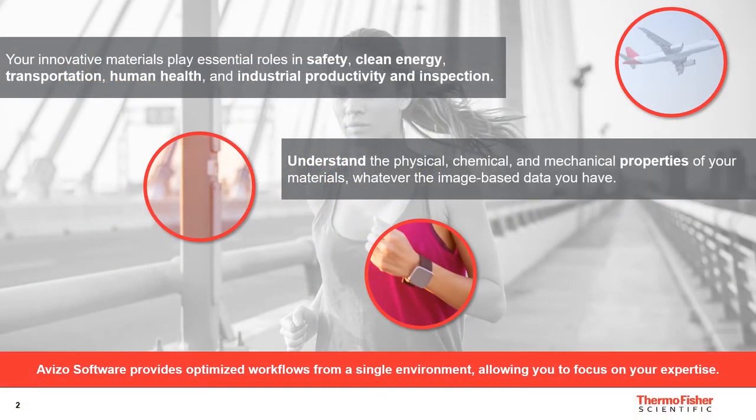Your innovative materials play essential roles in safety, clean energy, transportation, human health, and industrial productivity. To fuel continued innovation, you want to deepen your understanding of the physical and chemical properties of your materials, whether morphological, structural, magnetic, thermal, and mechanical at any scale. Avizo Software provides optimized workflows for advanced material research and quality control from a single environment, allowing you to focus on your expertise.